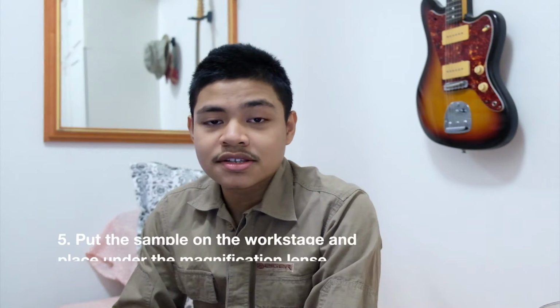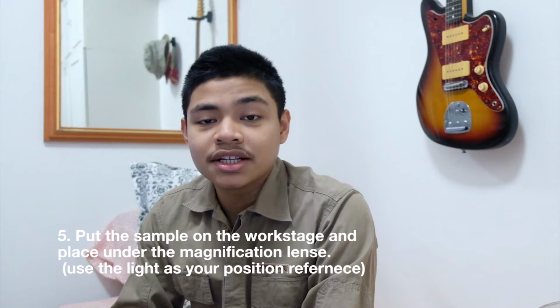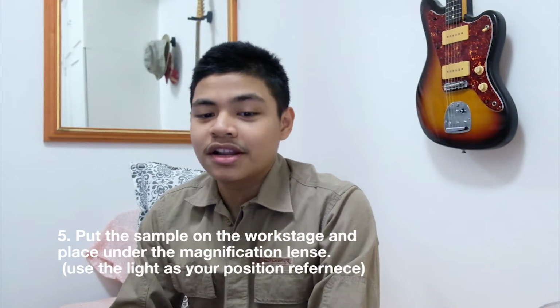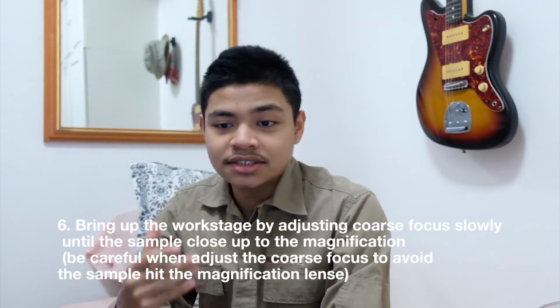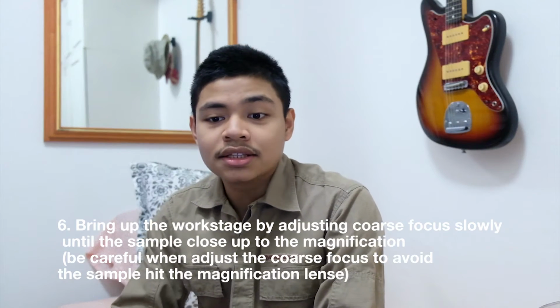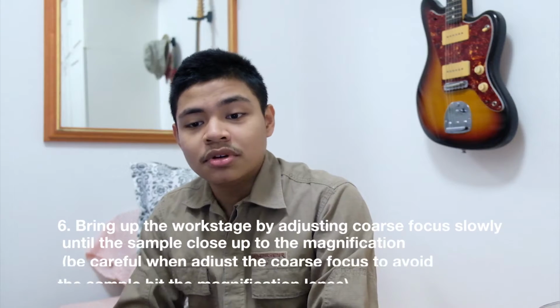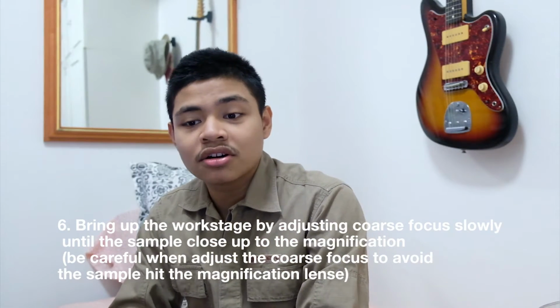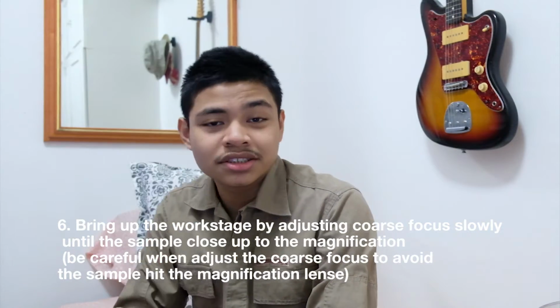And the fifth one is put the sample on the workstation and place it under the magnification lens. Please use the light as your position reference. And number 6 is bring up the workstation by adjusting the coarse focus slowly until the sample is close to the magnification lenses. Be careful when adjusting the coarse focus to avoid the sample hitting the magnification lens.